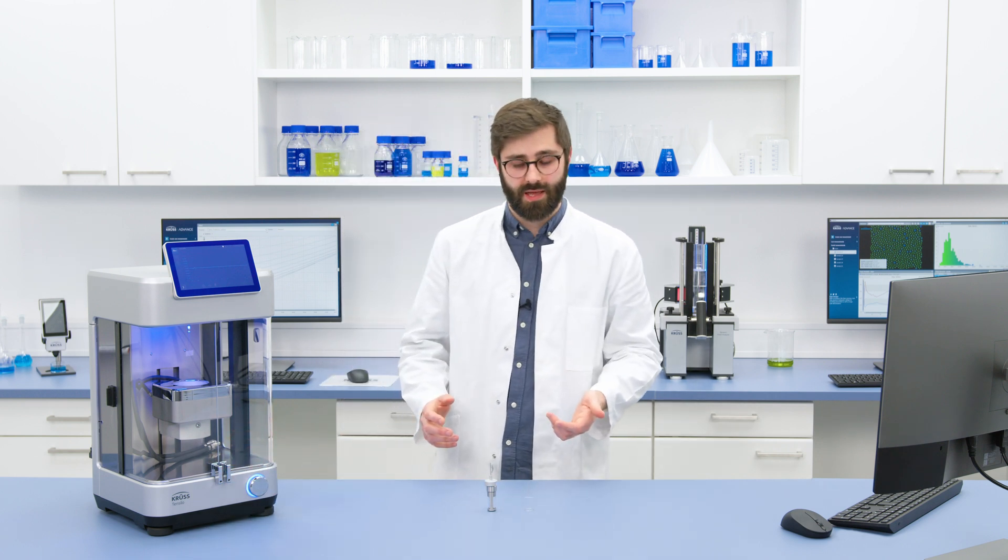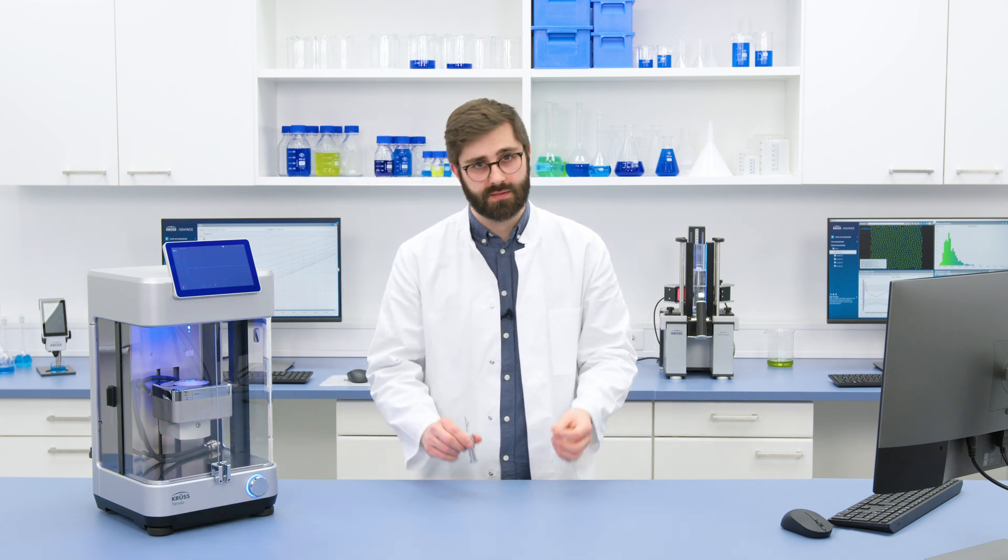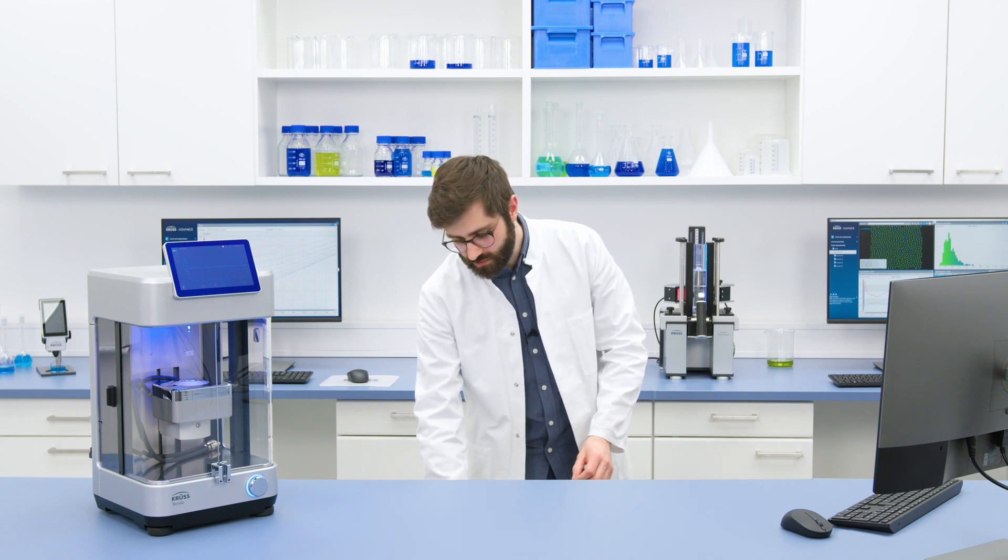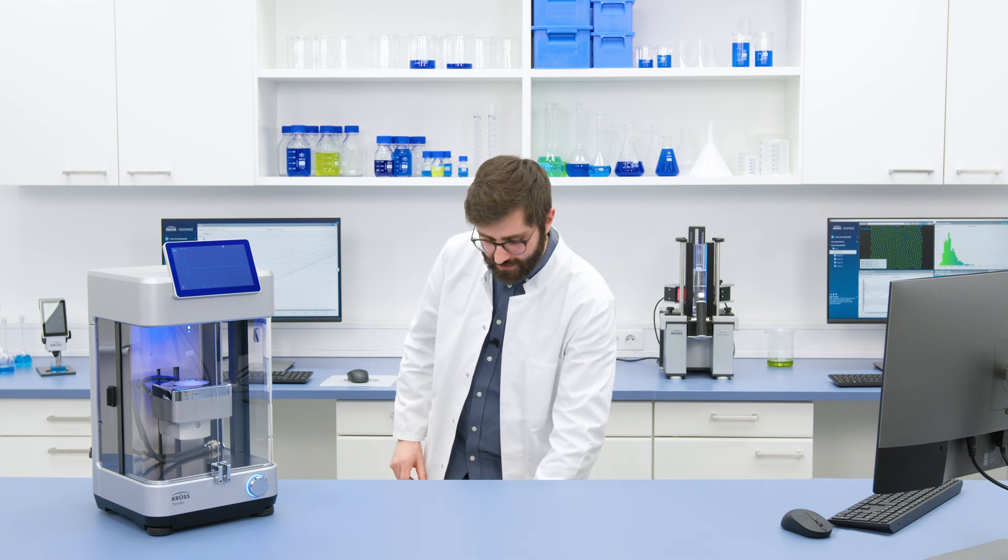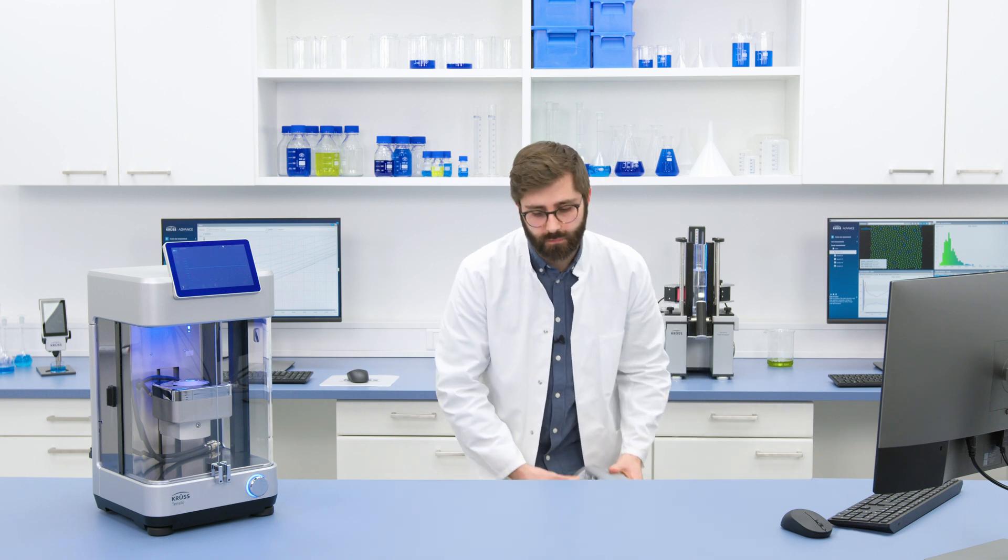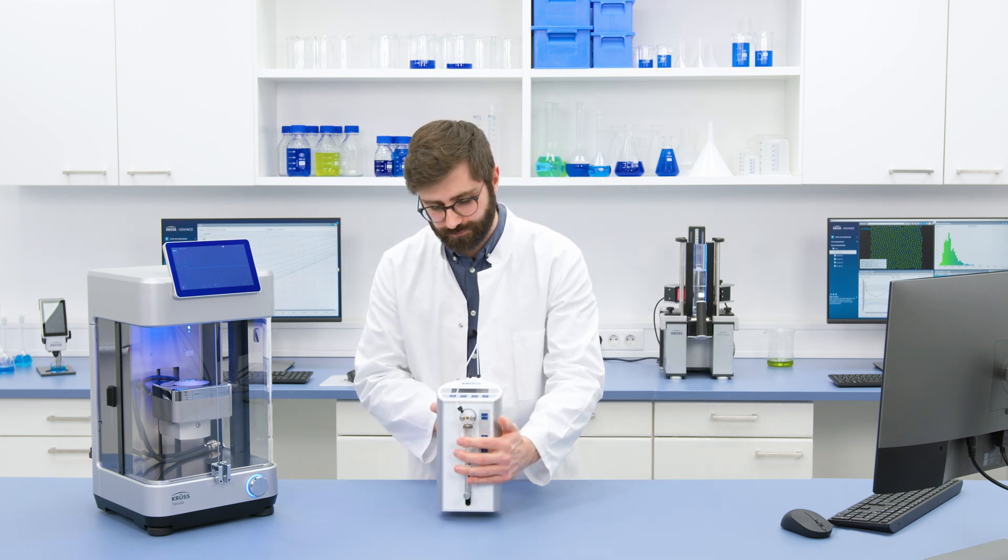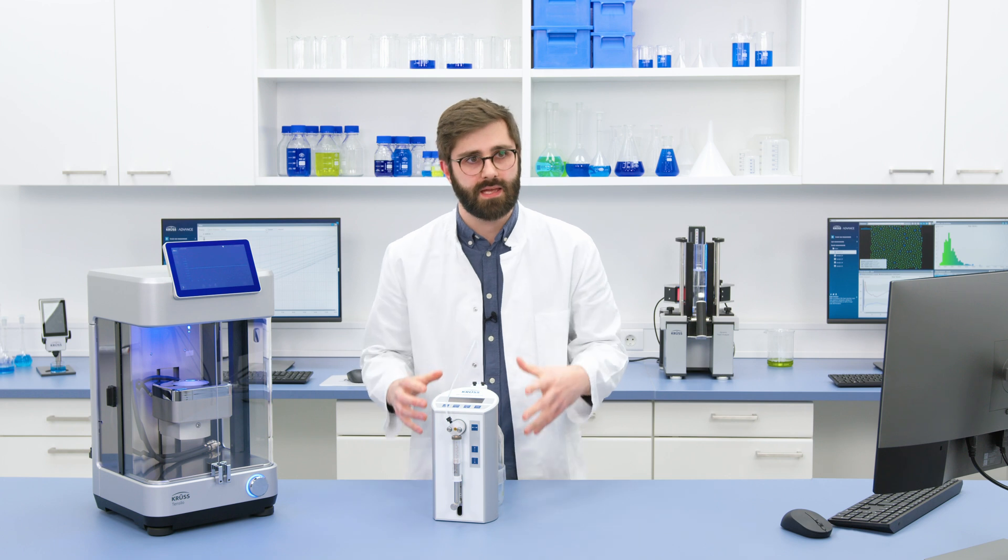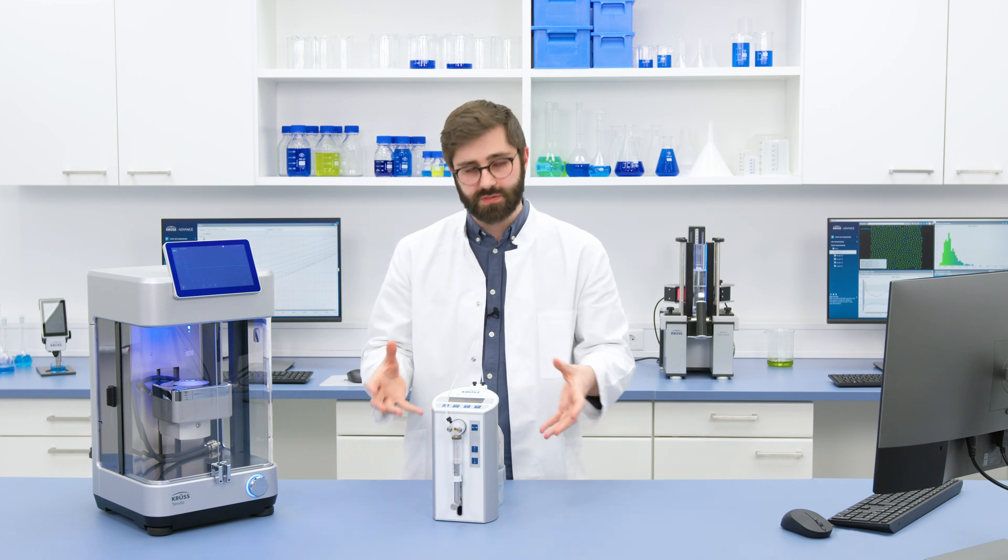And of course it wouldn't make sense to talk about a tensiometer without mentioning critical micelle or CMC measurements. And for Tensio we have this, which is a CMC dosing unit.